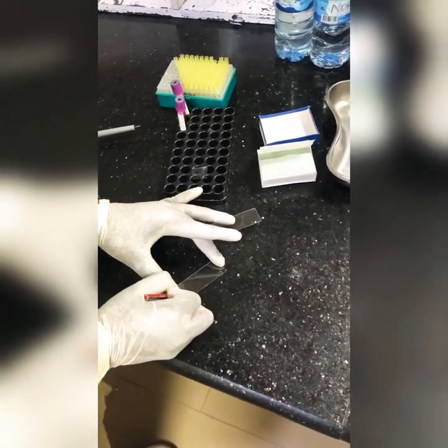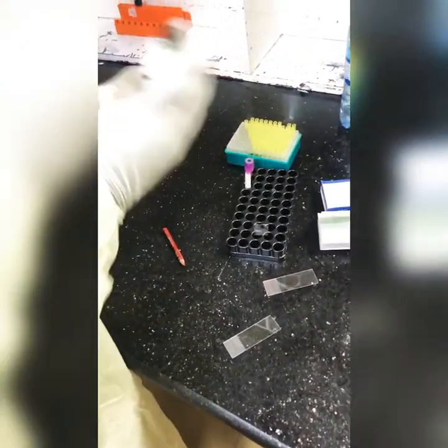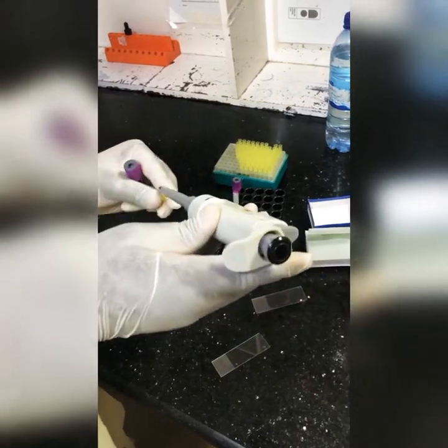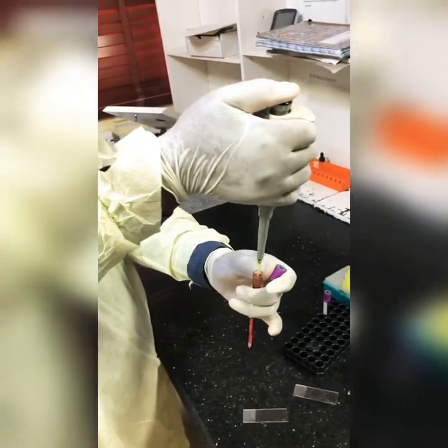There are different things you could use to make thin films — you could use a cover slip, or you could use another glass slide. Just basically use what works for you.